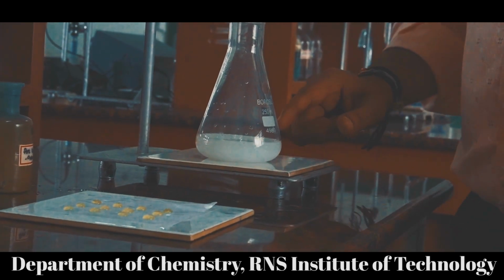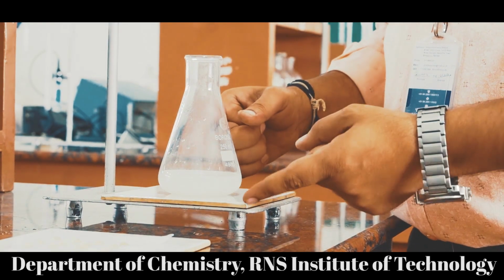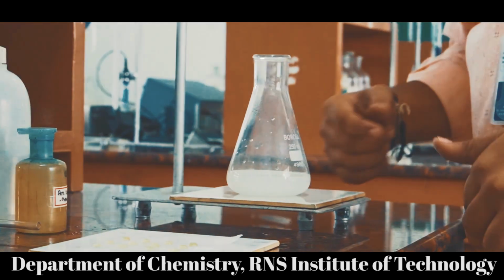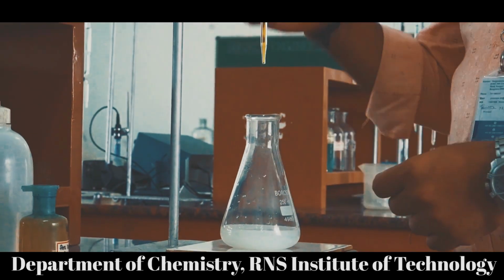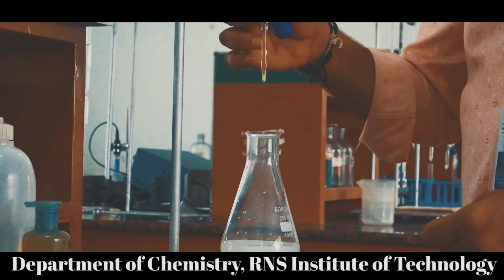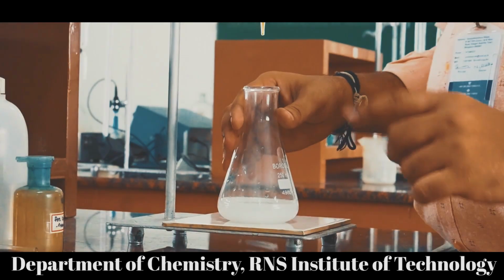It will oxidize Fe2+ to Fe3+, but stannous chloride, if it is there in the solution, what it will do, it is a reducing agent. It will reduce back Fe3+ to Fe2+. Because of this, the amount of K2Cr2O7 consumed will be more than expected. Okay, so keep that in mind.